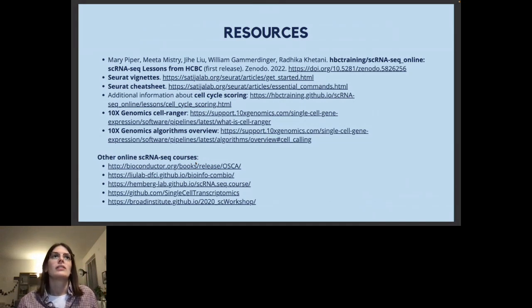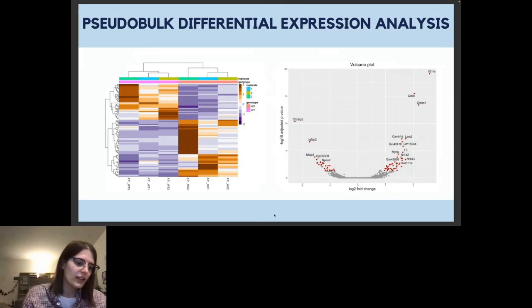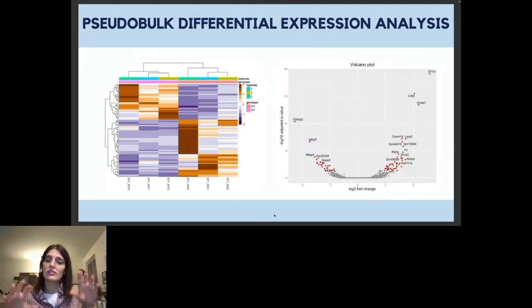Here, just for the downstream analysis, and just to give you an idea, we can perform a pseudobulk differential expression analysis. What does it mean? For example, in the dataset that we explored, we had stimulated against control cells. For each cell type, so for each cluster, we can aggregate the counts of each cell in order to have a pseudobulk in that cluster, and then perform classical differential expression analysis, for example, with DESeq and similar tools. And we can see whether the stimulus has changed the expression in that cell type.